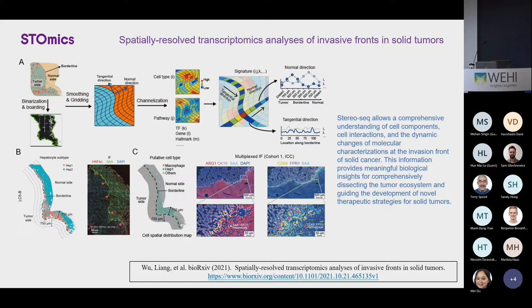And when you encounter things like immune checkpoint inhibitor therapy resistance, why and how do those resistance mechanisms occur, and how do you overcome them? So the answers to all those questions can be found with spatial precision medicine when you get down to this kind of resolution, and we're able to do multi-omics and better analysis with it as well. And of course also studying things like tertiary lymphoid structures, and applying algorithms like CellPhoneDB with the Stereo-seq data to look at spatial cell-cell interactions.